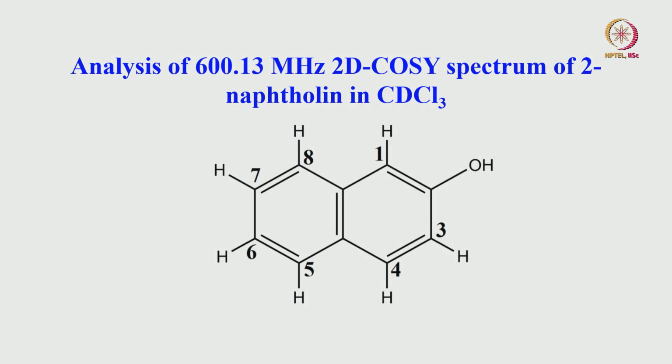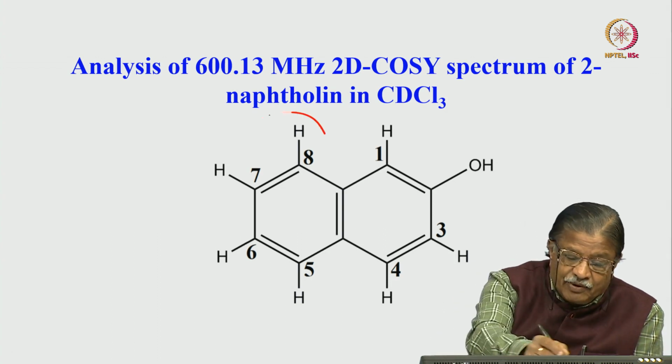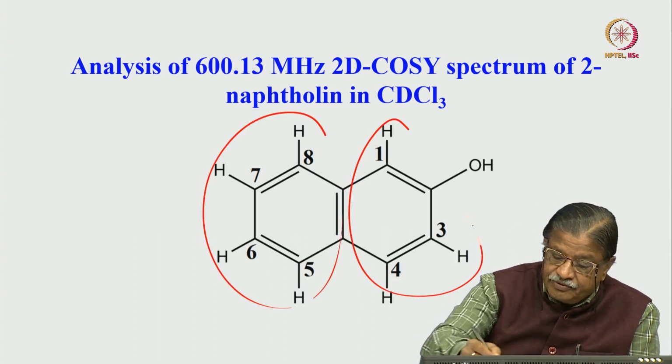Some complications will come at times. I will take the example of the proton analysis of phenyl groups. I have deliberately taken this molecule. Remember, here there are 4 protons. Here there are 3 protons.